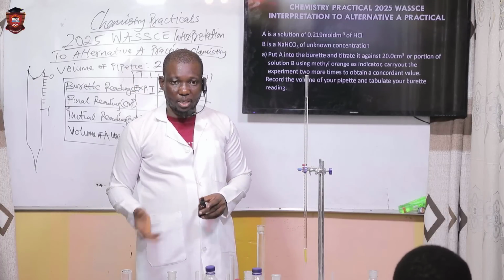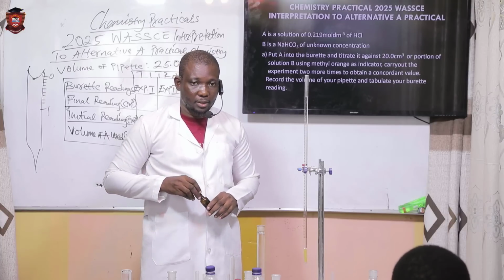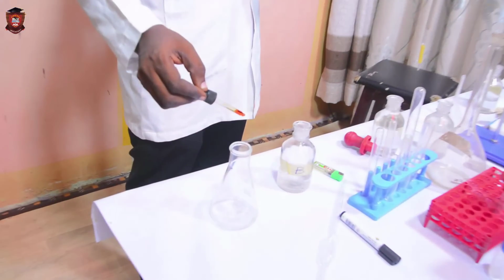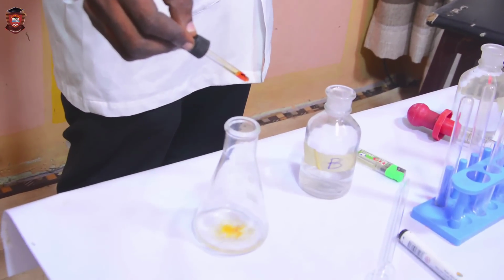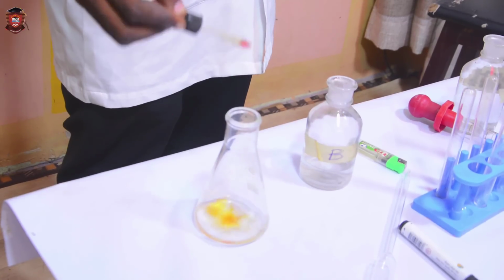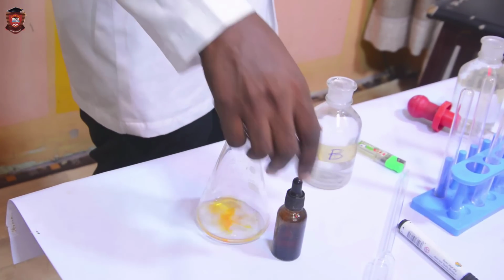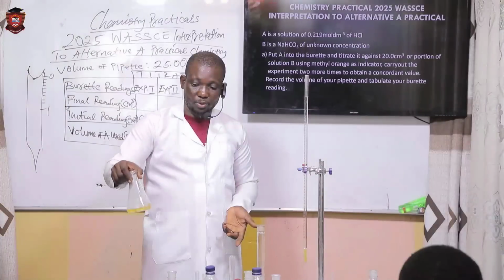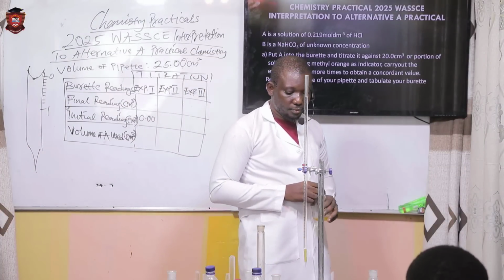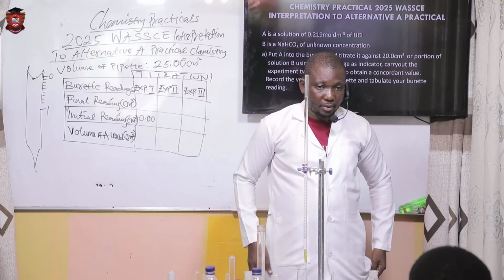So in alkali medium, there is the color of methyl orange we show. And which color is that? If I add 2 drops here, which color are we expecting? Let's see. I add 2 drops. The minimum is 1, but we can use 2 in this video. 2 drops, okay, that's the maximum. If you use 3 drops, it could overshoot the end point. So that's why we use 2 drops. What's the color? Yellow. So what color are we going to be looking at as our end point?